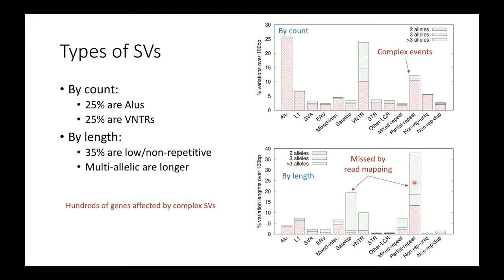And these genes are often medically important, also evolutionarily important, like the LPA gene I showed just now. And also the genes affecting immunity, and all the complicated genes, like those affecting brain functions, the amylase genes, and those under rapid selection are all in this category. And so if you want to study these genes, assembly is actually the better approach. You wouldn't do much with just read mapping.